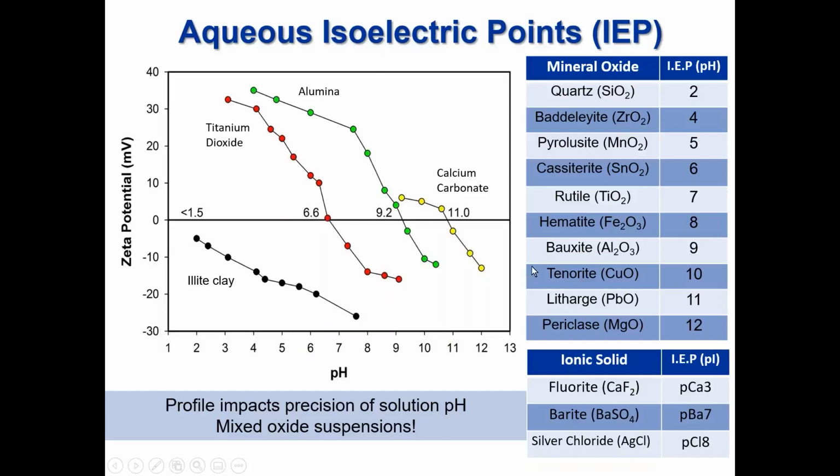If it is manufactured by the hydrolysis of titanium tetrachloride, then sodium or potassium chloride must be avoided, since chloride ions will specifically adsorb, changing the Zeta potential profile, including the isoelectric point. It is much better to use sodium or potassium nitrate.